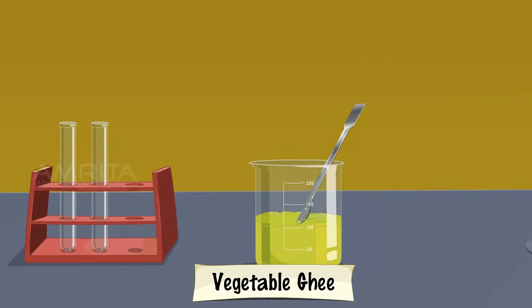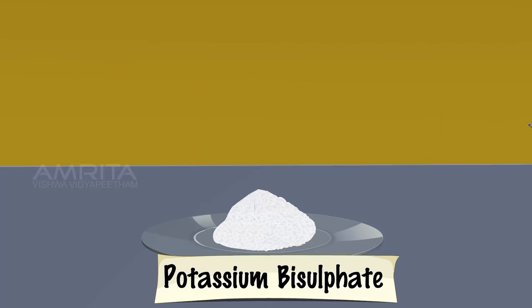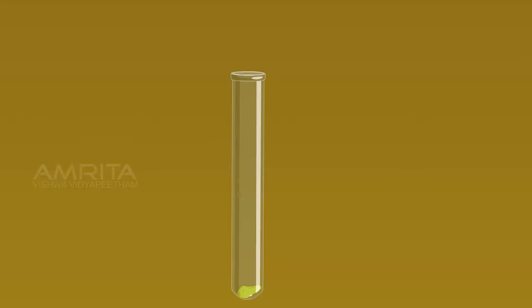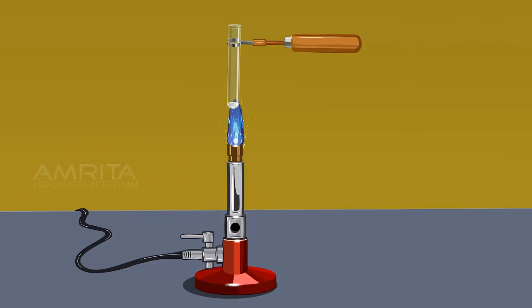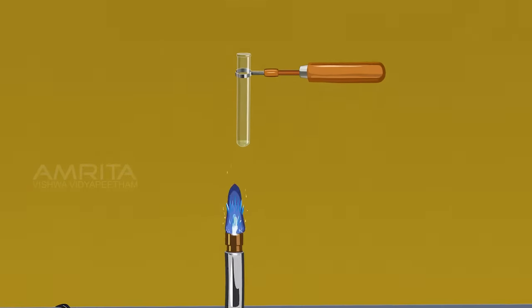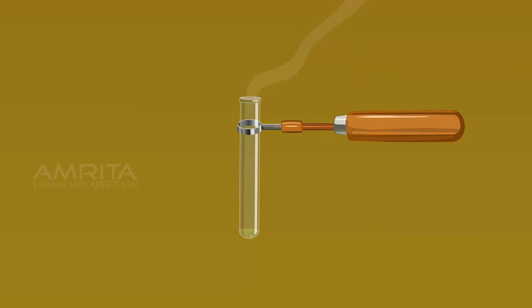Vegetable Ghee. Using a spatula, take a small amount of vegetable ghee in a test tube. Using another spatula, take a small quantity of potassium bisulphate crystals and add them into the test tube. Hold the test tube with the test tube holder and heat it over the Bunsen burner. When fat is heated strongly in the presence of a dehydrating agent like potassium bisulphate, the glycerol portion of the molecule is dehydrated to form an unsaturated aldehyde called acrolein, which has a pungent irritating odour.